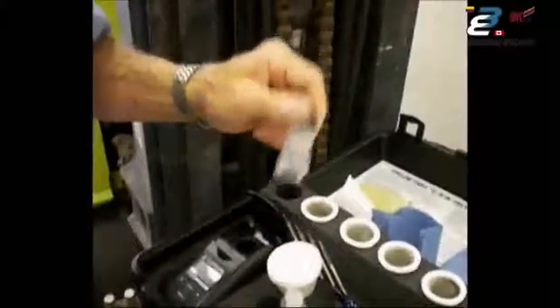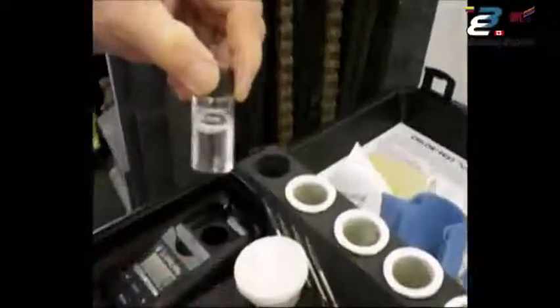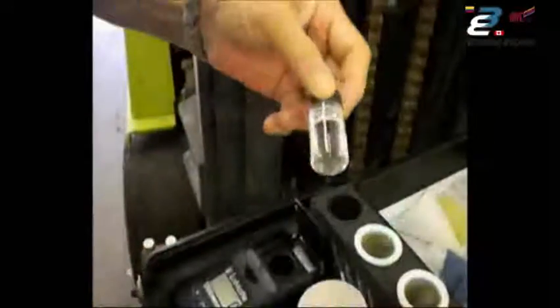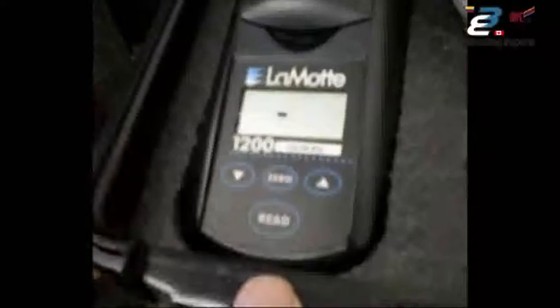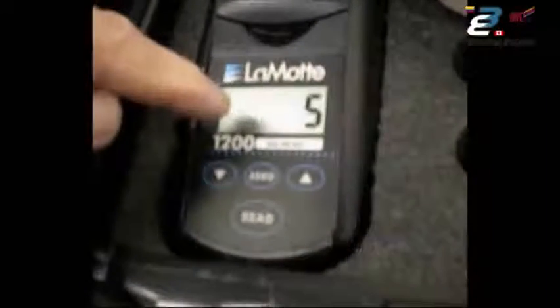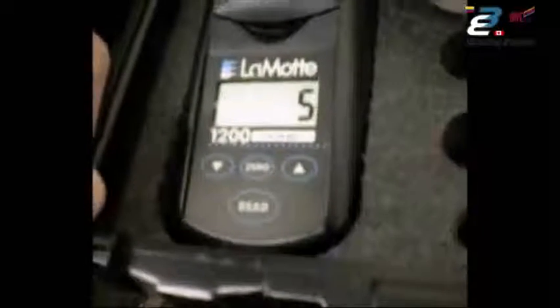There is a specified time for shaking — it's in the directions. Since we've handled the bottle again, wipe off any fingerprints. Line the line up, put it in the meter, close it, and press the read button. It's showing sulfates of 5 parts per million, or 5 micrograms per square centimeter, which is 50 milligrams per square meter.